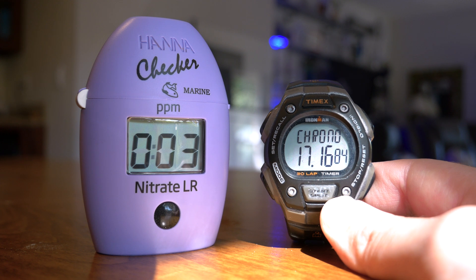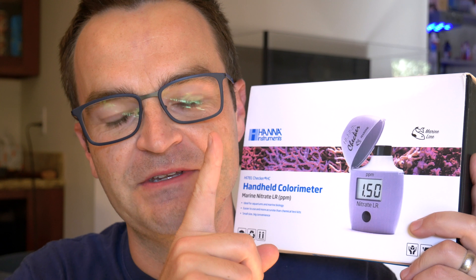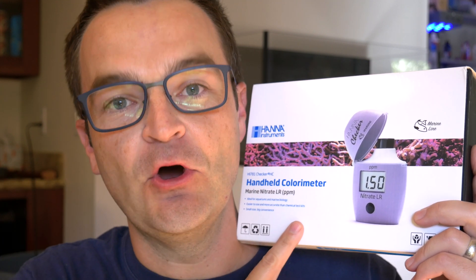It took me 17 and a half minutes to use this the first time — for one test. I test four tanks, so this would take me over an hour just to test nitrate every weekend. The first thing you need to consider before starting your test is: do you think your nitrates are over five parts per million?